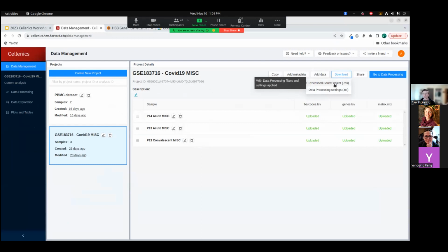The one issue with this right now is that, as you mentioned, it doesn't have that cluster information. This is sort of an unfortunate side effect where we're storing that as a different file in the platform. But this feature has already been added. It just needs to be released. So, within a month, you will be able to do that. And that will apply for any previous data sets that you've created as well. So a great question. That will definitely be there soon.